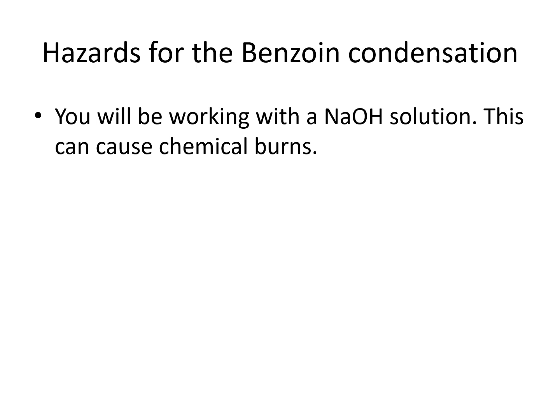Safety matters regarding this experiment. If you remember from the experimental procedure, we used sodium hydroxide. Sodium hydroxide is a strong base which is corrosive to our tissues. For that, we have to be careful in using it.